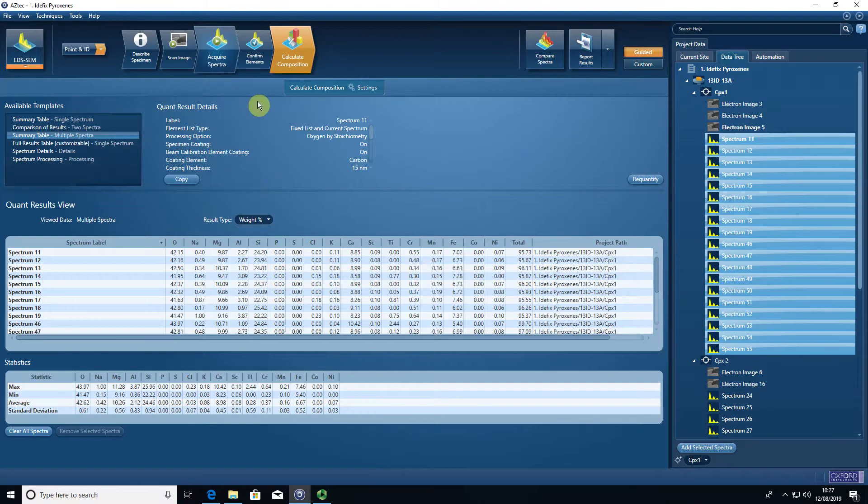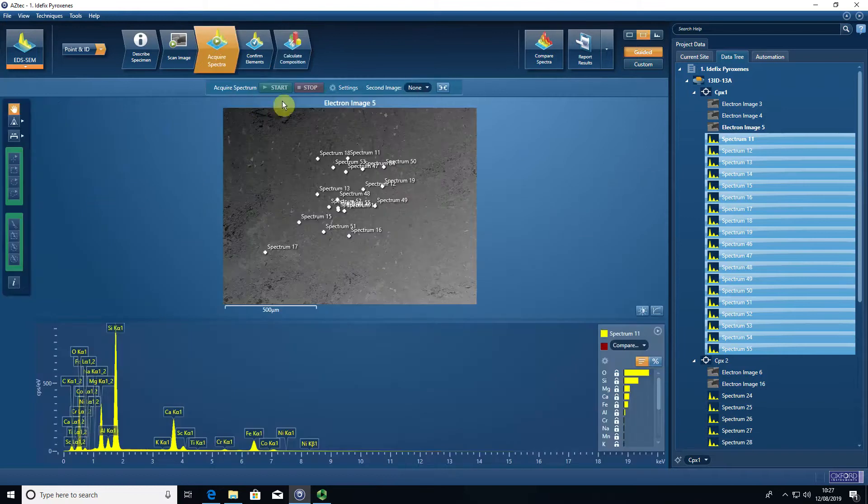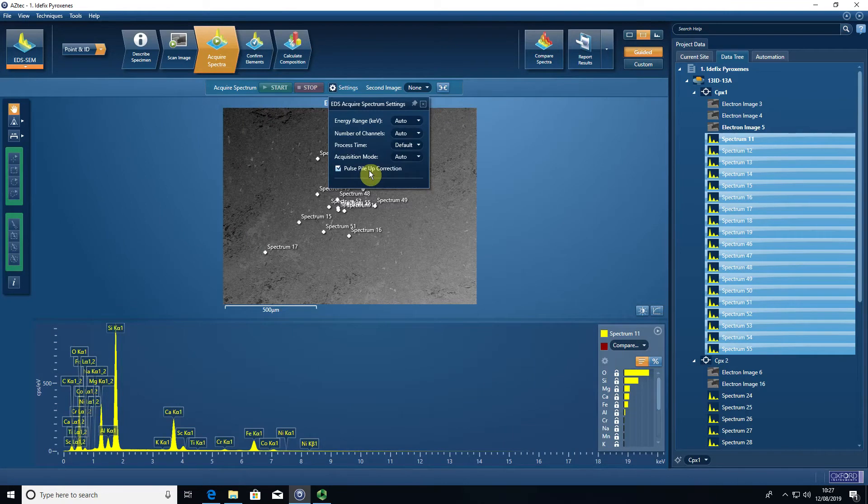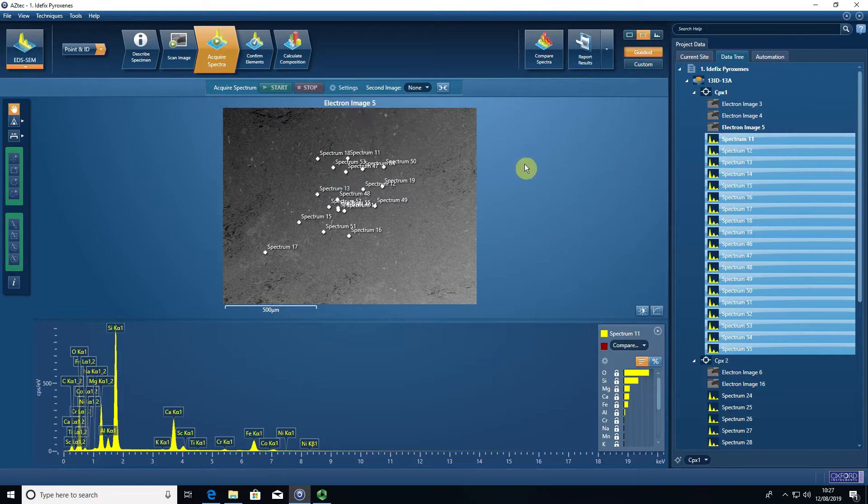The other really important thing is that in acquire spectra in the settings, the pulse pileup correction is selected. We've had problems in the past where people have deselected this, and that can cause issues with your quant data. Make sure that pulse pileup correction is corrected before you export your data.